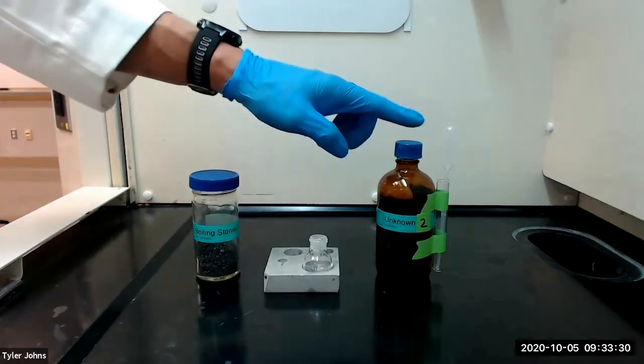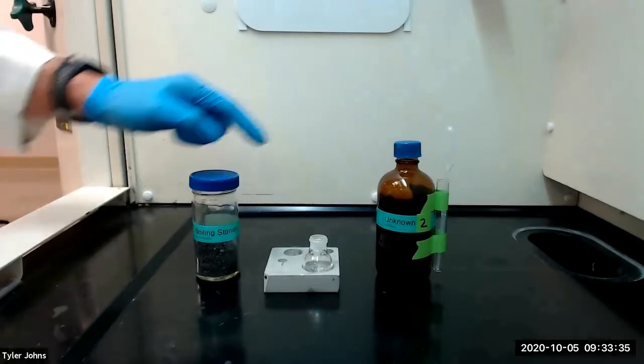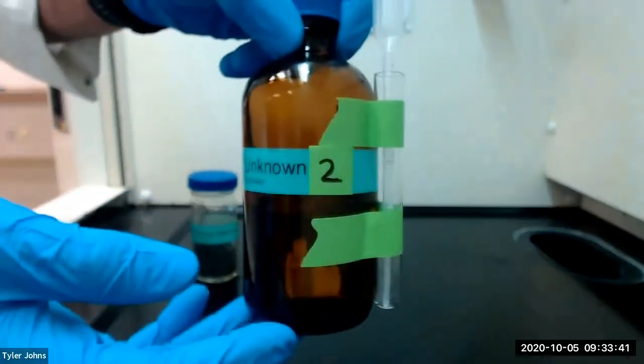Let's get started. We first need to add 8 milliliters of our unknown mixture of liquids and a boiling stone to a 10 milliliter round bottom flask. For this experiment, we'll be using unknown number 2.